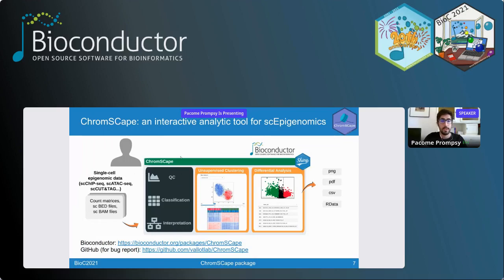ChromSCape is an application that takes the user from quality control and feature counting towards interpretation, and visualizing the data at each step. And of course, any bug can be reported on the GitHub page.